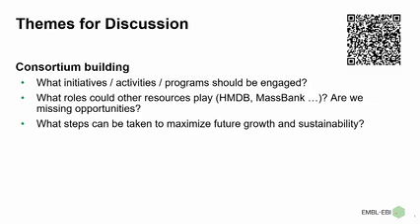And then the second comment would be in terms of instrumental parameters, to actually try to retrieve as much as possible from what we researchers think the information is. It can be the raw data, where all the instrument parameters should be there, depending on how you acquire, but most of it would be there. Sometimes depending how you hyphenate, for example, your LC with your mass spec, if they are not married well because of two different vendors, then you don't have the LC parameters or not enough granularity.